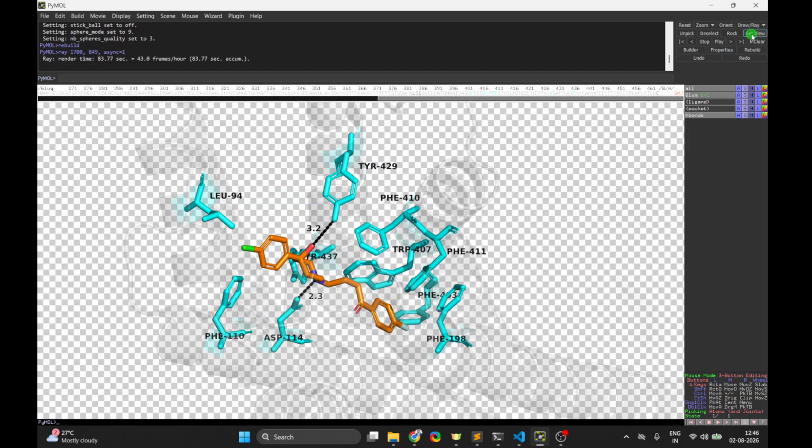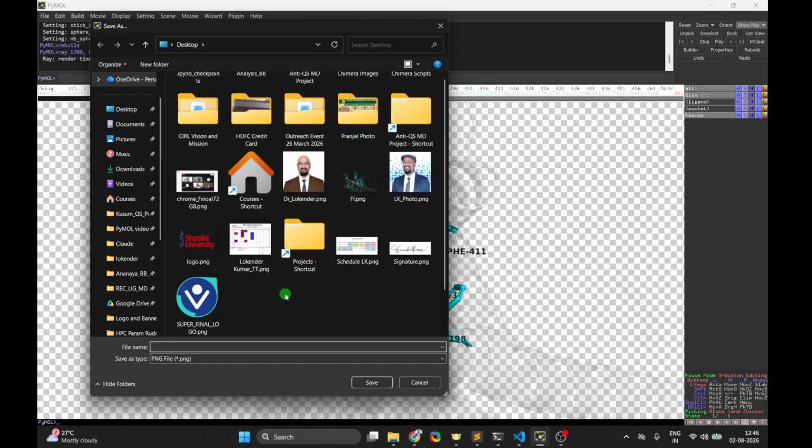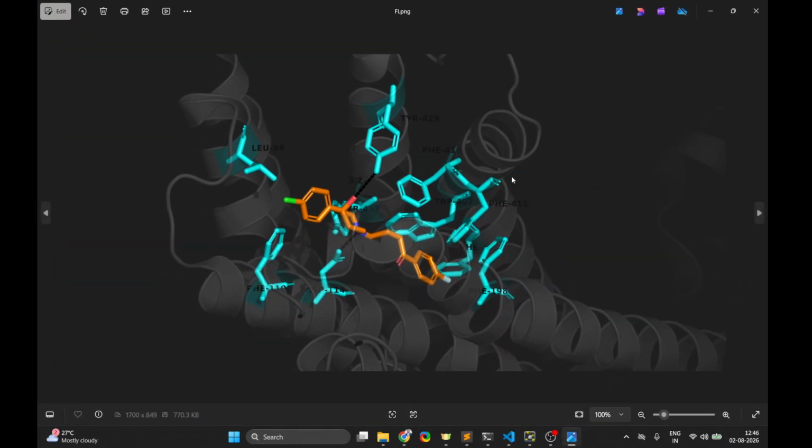Okay, as you can see, our image is ready. Let's save this image on desktop, right? Okay, I'm just giving random numbers. It took some time, so we have 2 images that got saved. It will look like this. Look at that. This is the final image.